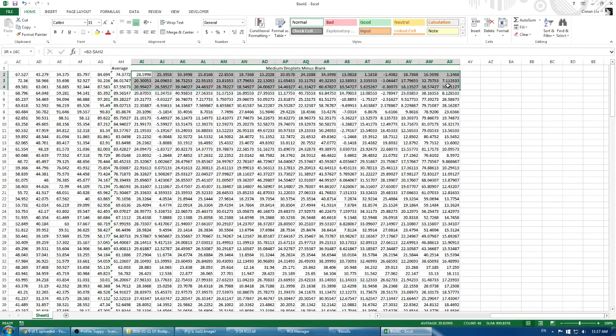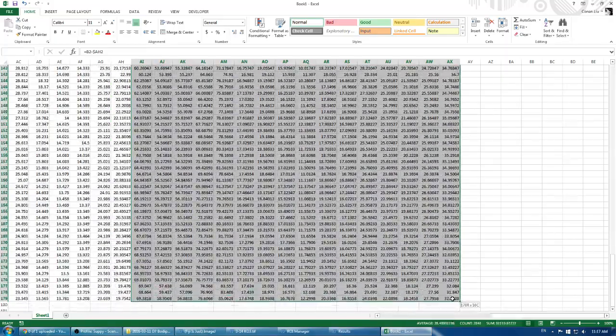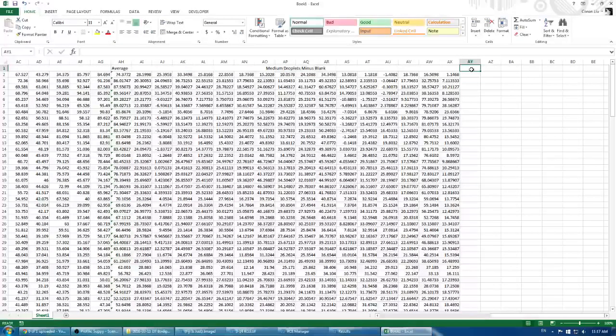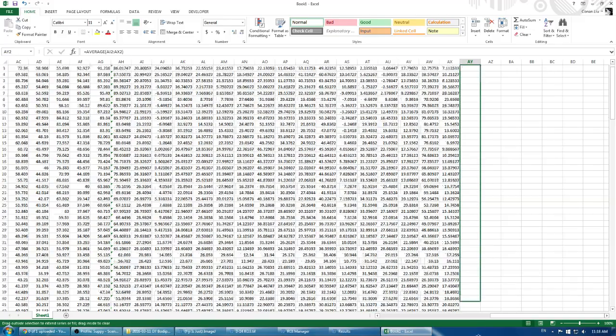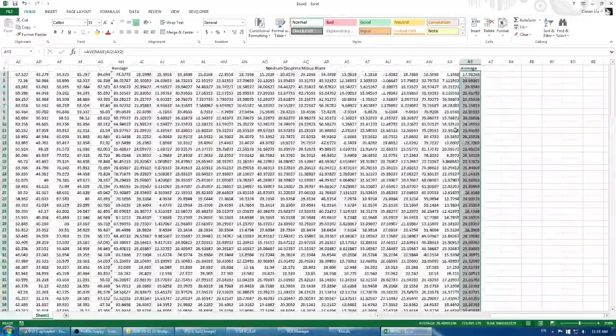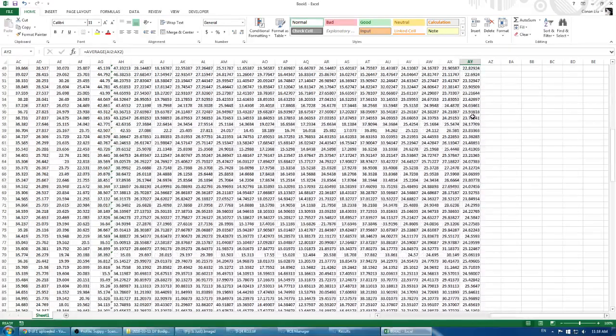We can make a graph in GraphPad Prism or in Excel, and these are going to be all your replicates. So we have 16 replicates. So you just make an XY graph, and you're just going to get your fluorescence graph over time. And here we can get an idea of what the graph is going to look like if we average this out. We are looking at BODIPY uptake or fluorescence uptake, so we should expect to see these values to grow over time. And here we do see a slight growth over time, so 17 and slowly going up over time.